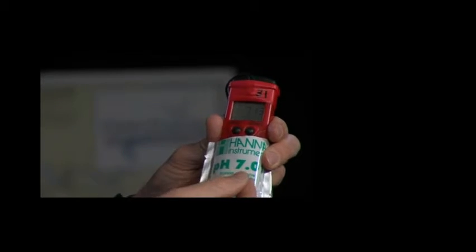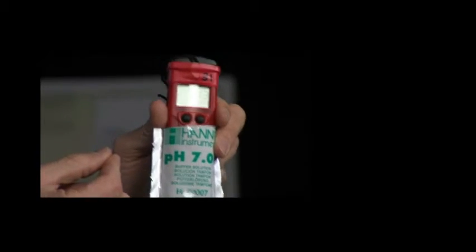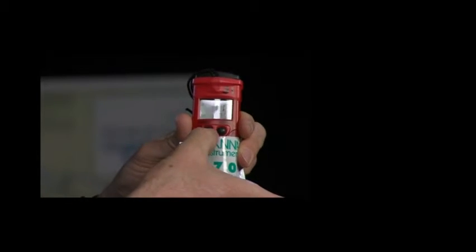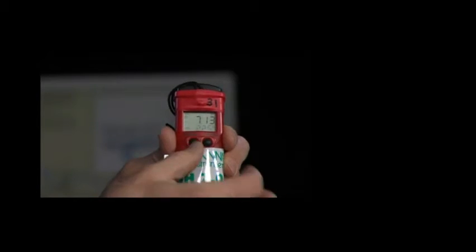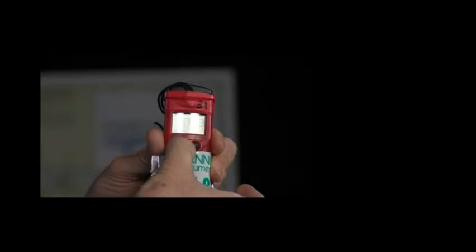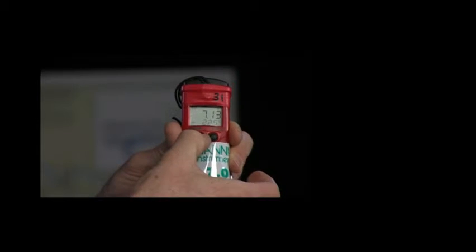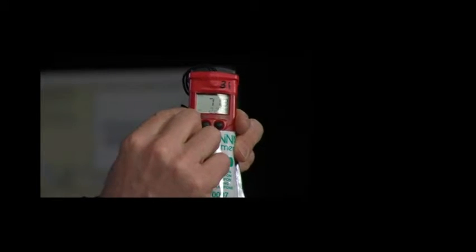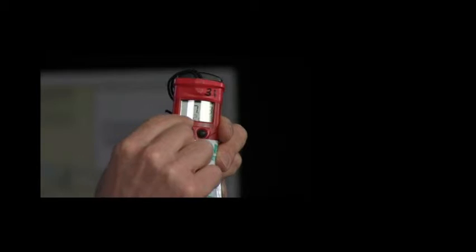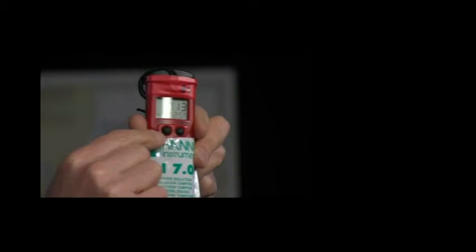The steps to calibrating it are we're going to push the left button in once and hold it. On the display it will say off. Then in a second it will show CAL, the letter C-A-L in the bottom. Once you see the letter CAL, you take your finger off the left button.